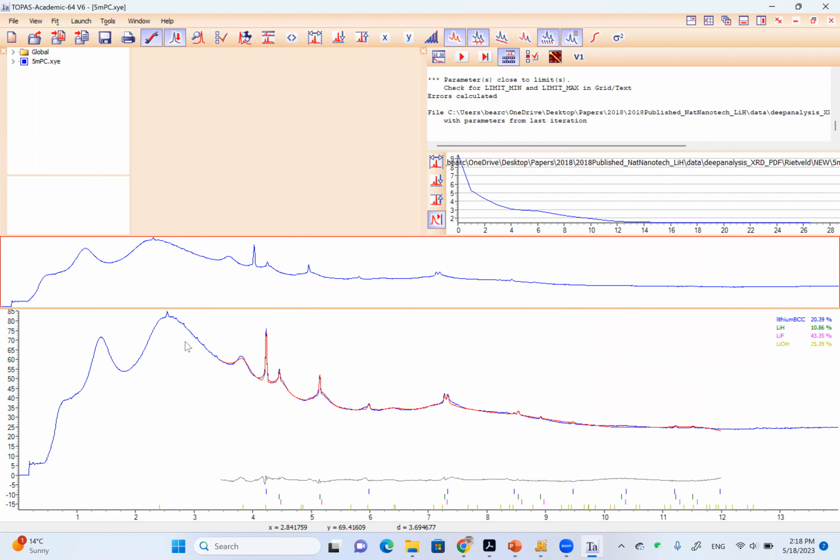So broad peaks at low angle indicate amorphous phases. That's observation number 1, and then number 2. I think you need to pay attention to the numbers. Like I mentioned previously, we're measuring interfaces, which are indeed very weak scatterers. So you see the numbers.